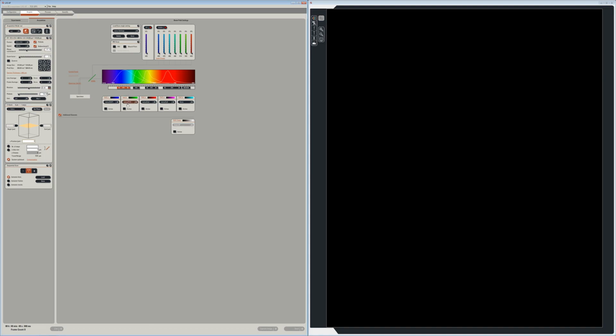The HyD detector, which is our second detector, we tend to not use this unless it's some specific people. This detector is newer, and it requires a very small amount of laser power. And if someone uses more than that laser power, it can be broken, and we've already had it replaced. So for most users, we usually ask to please not use this detector, just use the other PMT that's next to it. So in this case, I'm going to shrink it, and I'm not going to use it.